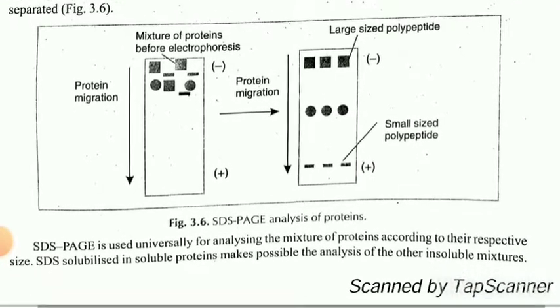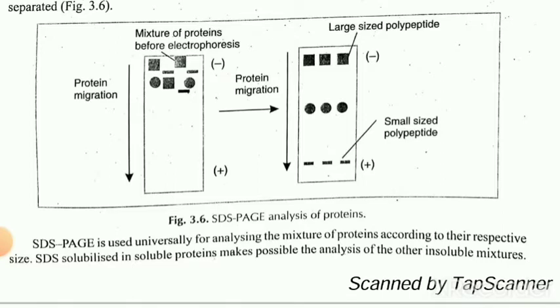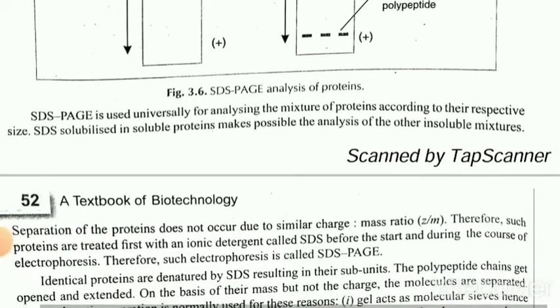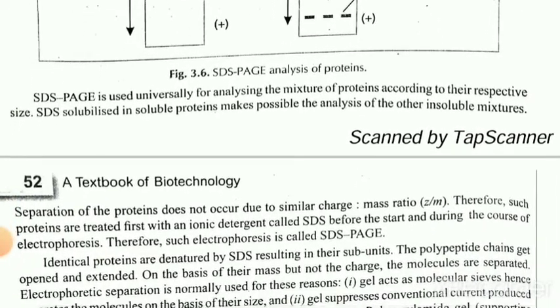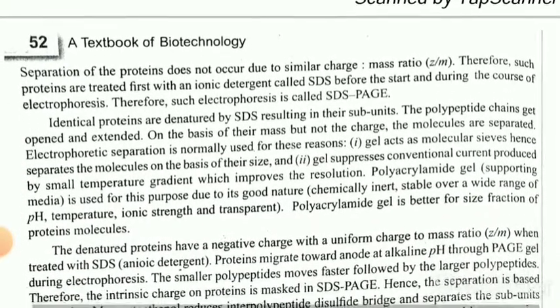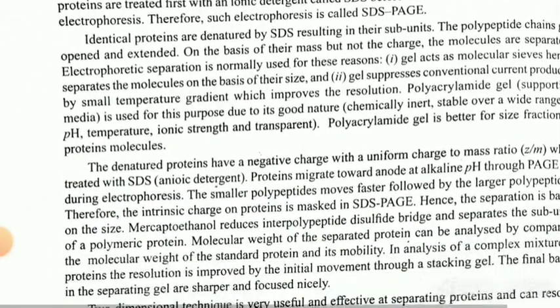Figure 3.6. SDS-PAGE is used universally for analyzing a mixture of proteins according to their respective size. SDS solubilizing insoluble proteins makes possible the analysis of otherwise insoluble mixtures. Separation of the proteins does not occur due to similar charge-mass ratio.